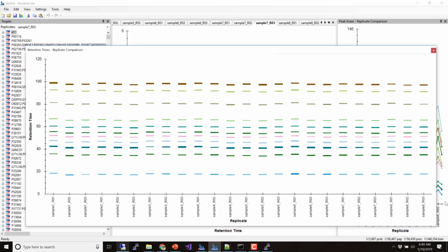What's the expectation? Each one of these colors represents a peptide. There are 11 peptides. Can anybody see anywhere where a peptide looks like it's probably not the right thing? No, it looks great, 24 across. They did a great job of collecting their IRTs. That matches our expectations.